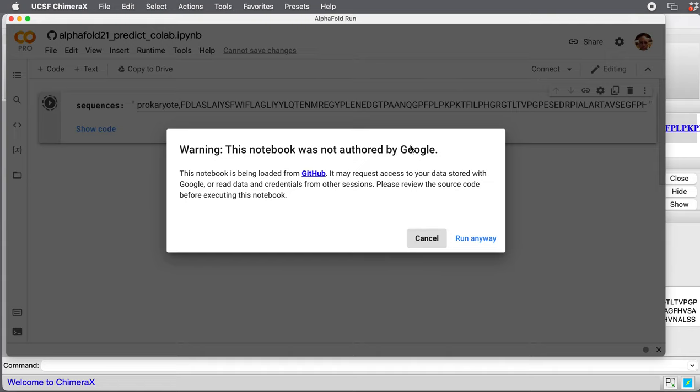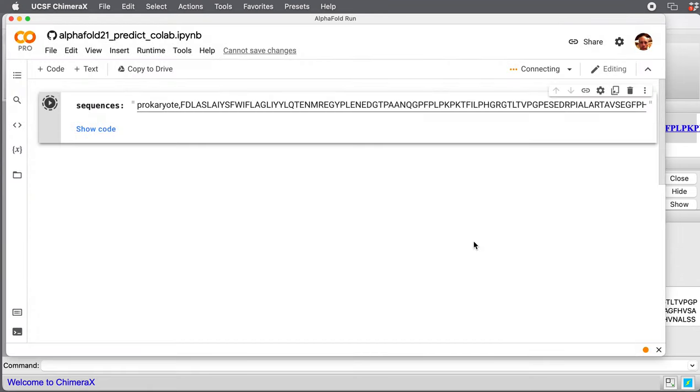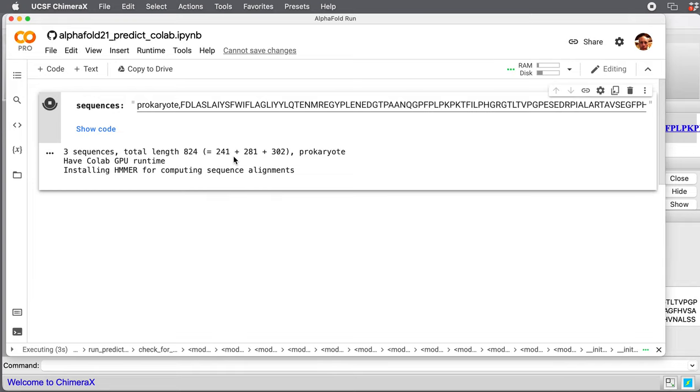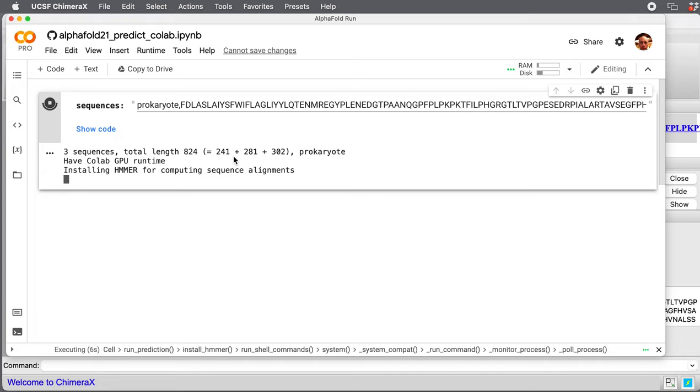Once you get through that, it will say we're running some code from Chimera X. It's not from Google. So we press run anyway. That's just a security message.